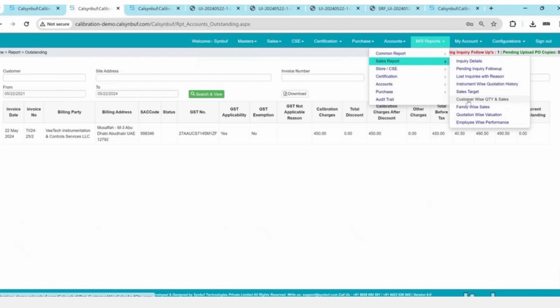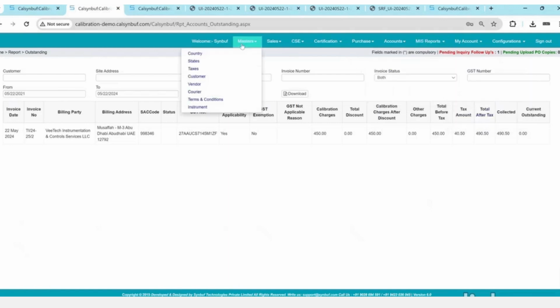So you have completed this certification area, right? Okay. Now next, shall I show you the customer module? Yes, please. Okay, so let me go to the customer first.